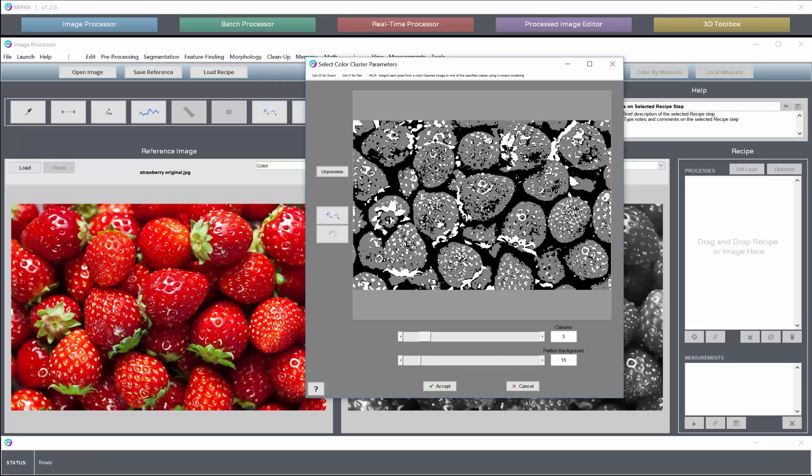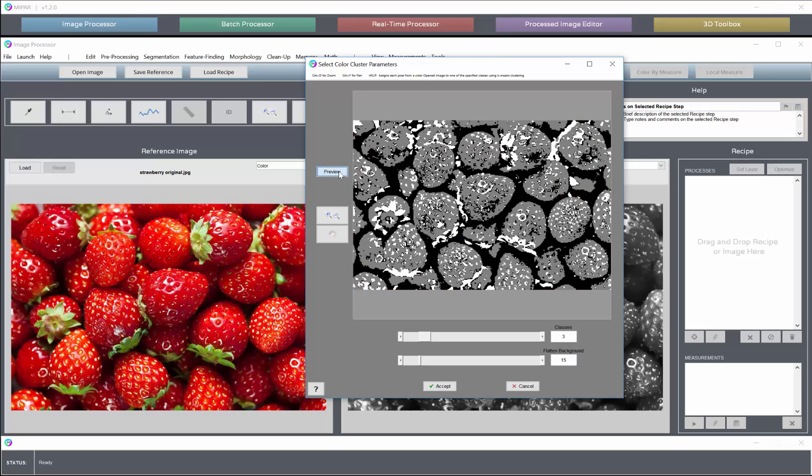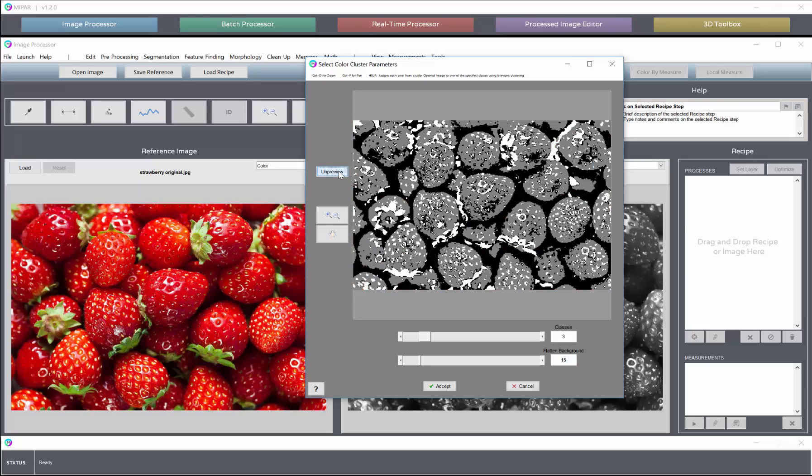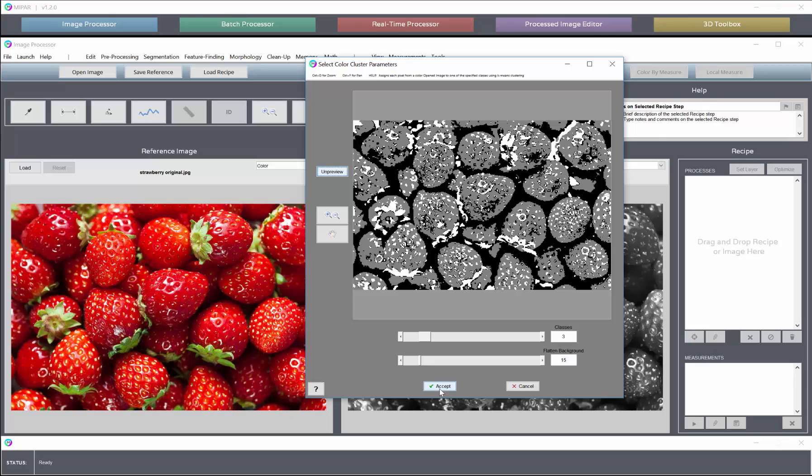So we can move this slider up a little bit. And now we start to detect the bodies, seeds, and stems objectively without any set threshold value. This is done simply by clustering the original image color space after it's been background corrected a bit.